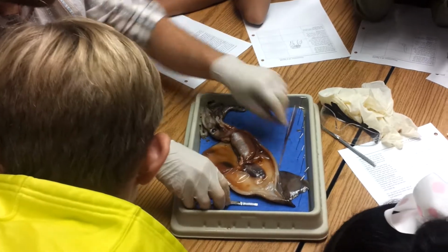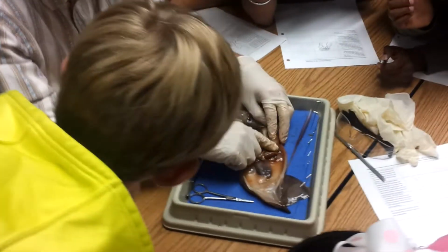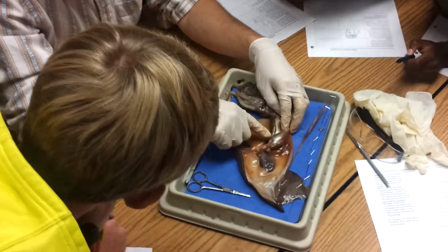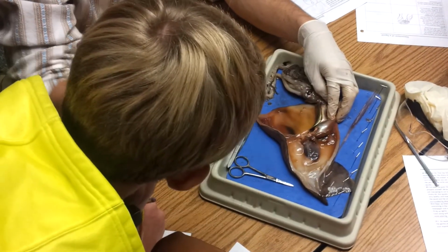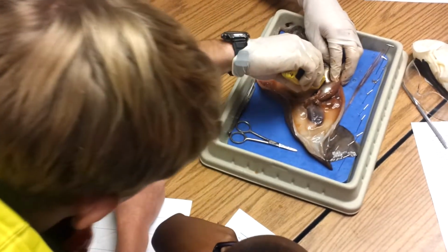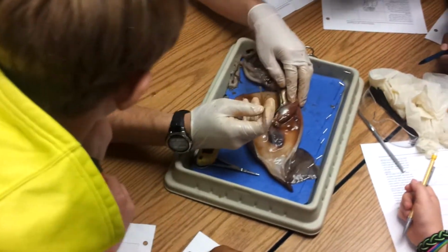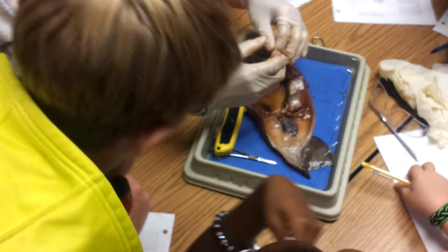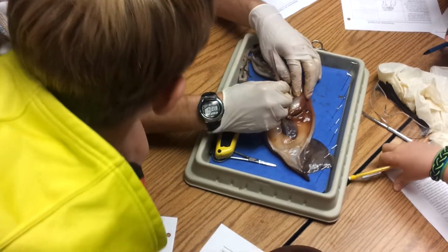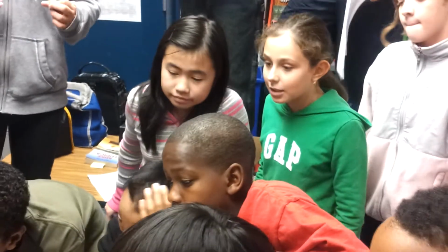All right, we're there. So, what I also want to show you is this dark strip over here. You see it? That's the ink sac. Okay? If I cut that open, get ready. Look, there's some black stuff in there. Can somebody grab me a piece of paper that no one's using? Anybody get him some paper? Put it right there in front of me. I don't want to touch it.